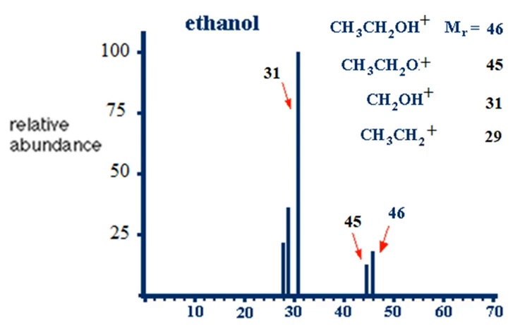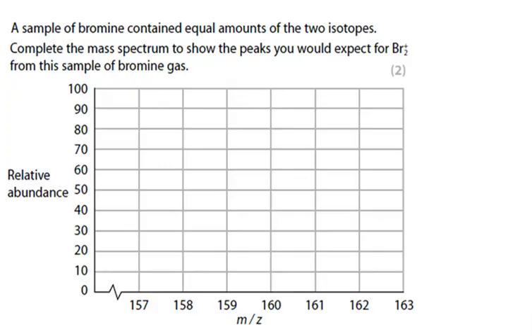What else can we do? Remove the OH so that I'm left with only the CH3CH2. Then I have a peak at 29. Do we understand this? This last one, we just removed one of the hydrogens from the fragment that has a mass of 29, so I end up with a peak at 28. Are we okay with all of this? I hope I haven't confused you too much.